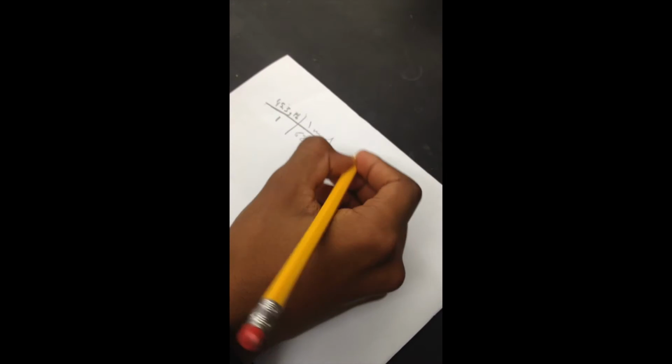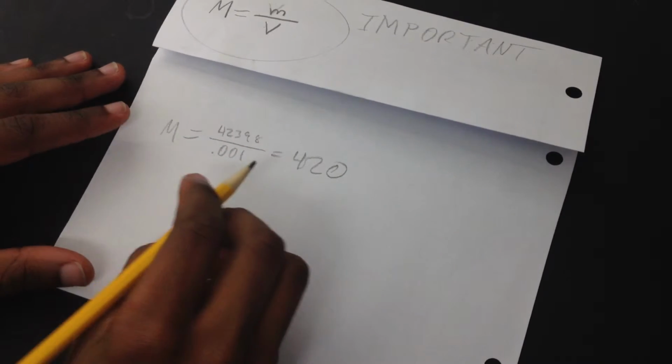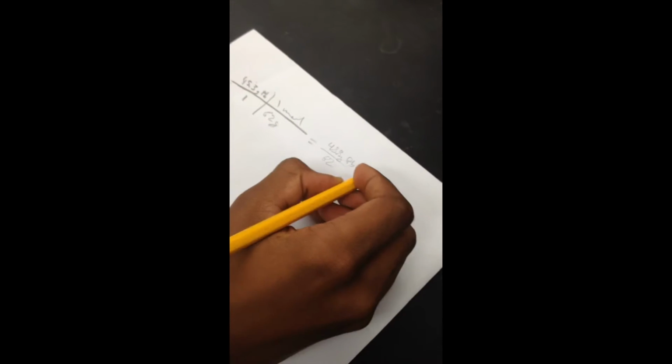Having filtered out and weighed the precipitate, which was found to weigh 0.11 grams, Gideon used the gram-molar mass of lead iodide to find how many moles of precipitate had been formed by the reaction. The final value was 2.4 times 10 to the negative 4th moles. Gideon then had to double this value due to the proportion of precipitate to murder weapon in the equation, getting 4.8 times 10 to the negative 4th moles of potassium iodide.